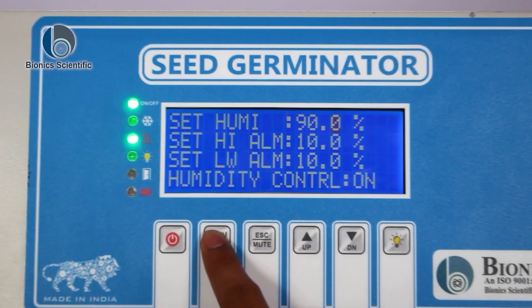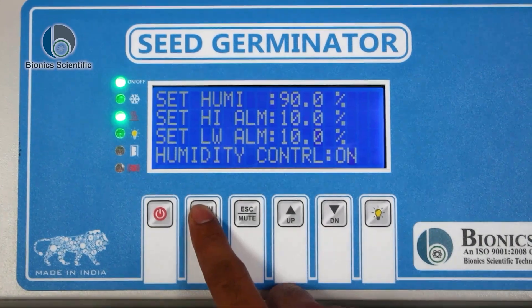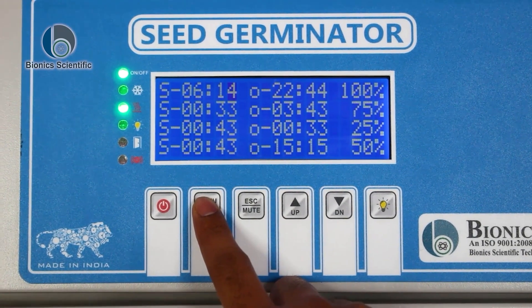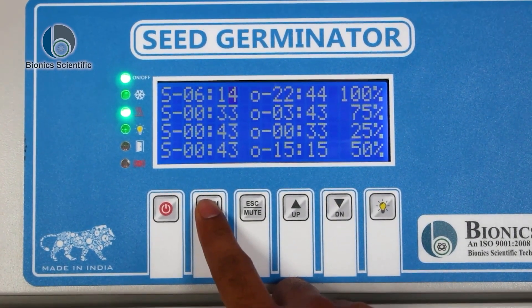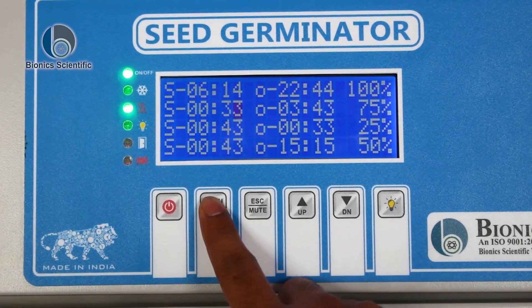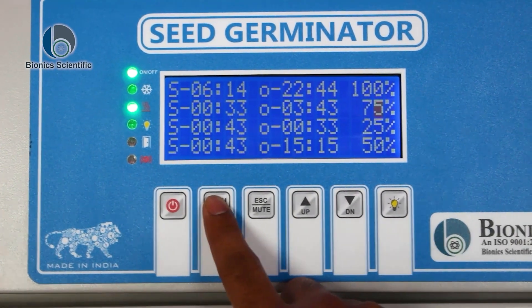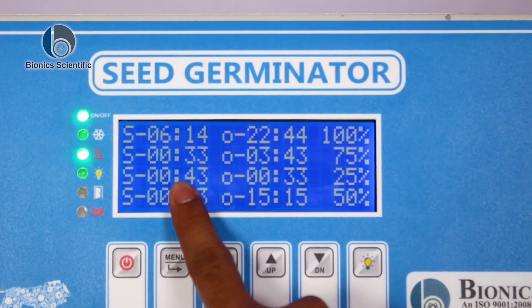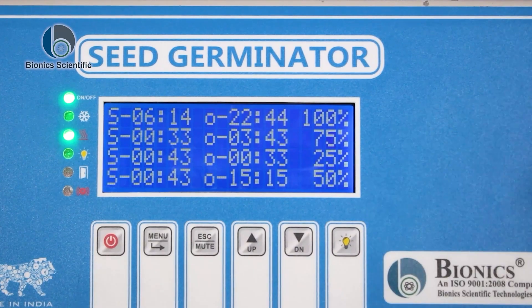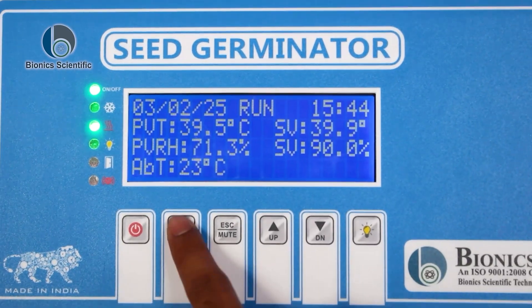Set humidity, set high alarm, set low alarm, humidity control on/off, data erase no, data USB no — please insert USB. These are the cycles present here. There are provisions for time, date, temperature, and humidity. As you can see, the time is mentioned and the lux is also present — 100%, 75%, 25%, 50%. These are the lux percentages set according to the cycles.